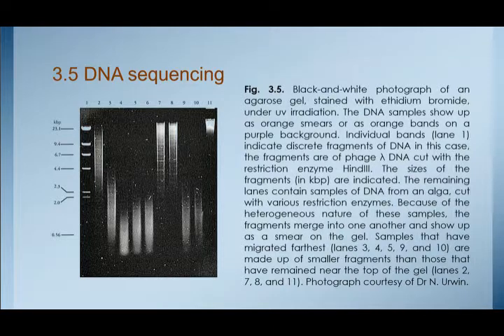According to Figure 3.5, individual bands in lane 1 indicate discrete fragments of DNA, in this case fragments of phage lambda DNA cut with the restriction enzyme HindIII. The sizes of the fragments in kilobases are indicated.